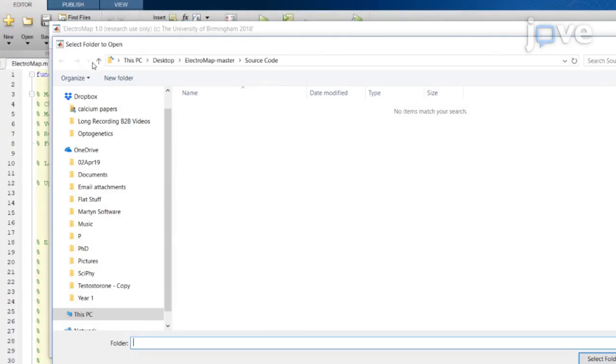Next, to load the image, press select folder and navigate to the location of the data file or files to be analyzed. Select the file to be loaded from within the interface and press load images.